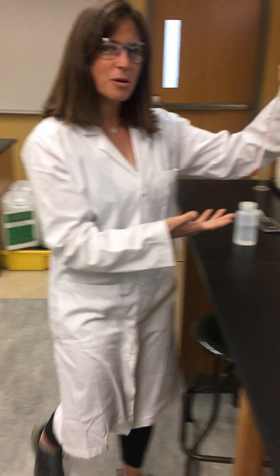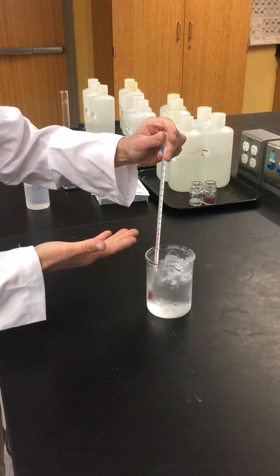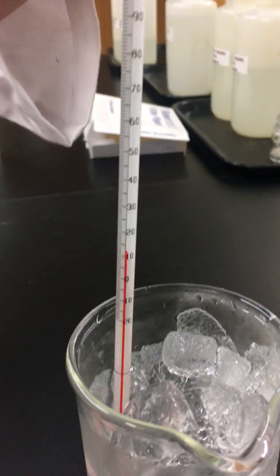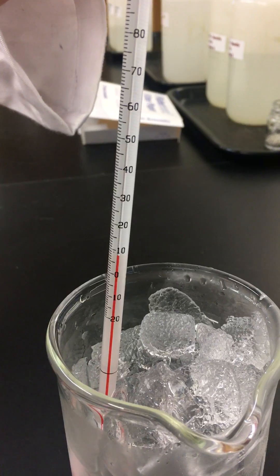So now we want to measure the temperature of the ice water bath. We'll place this inside and as you can see, the liquid inside is dropping. So again, we're going to wait until it stops moving and then that will give us the temperature of our ice water bath.